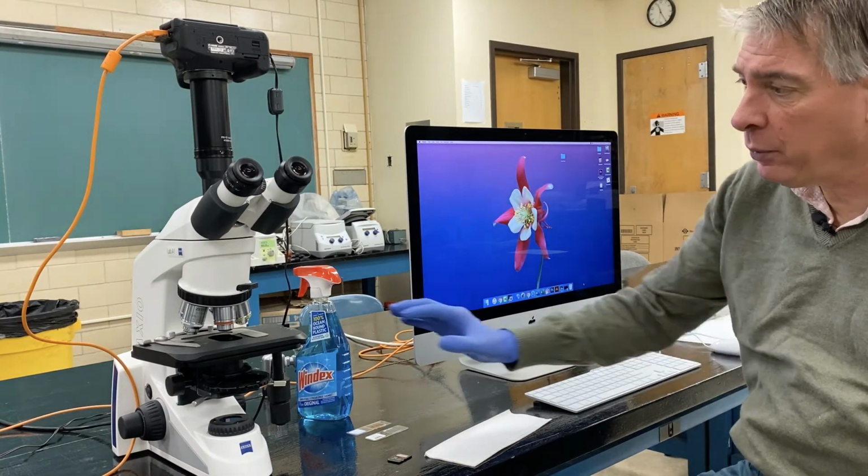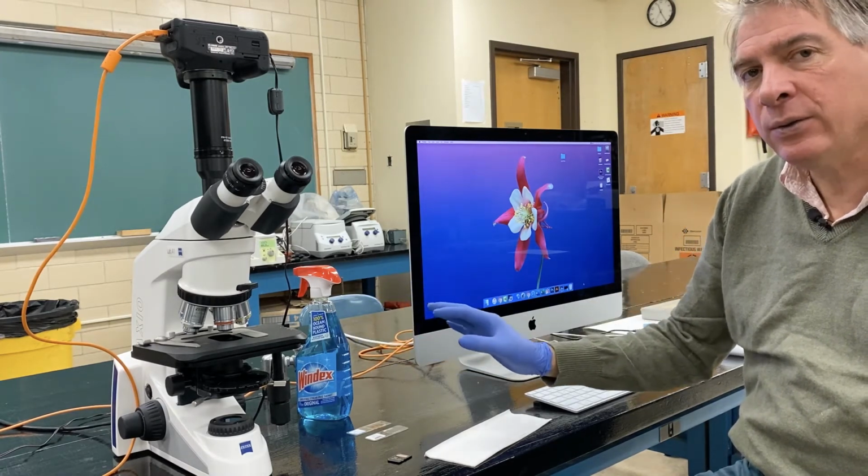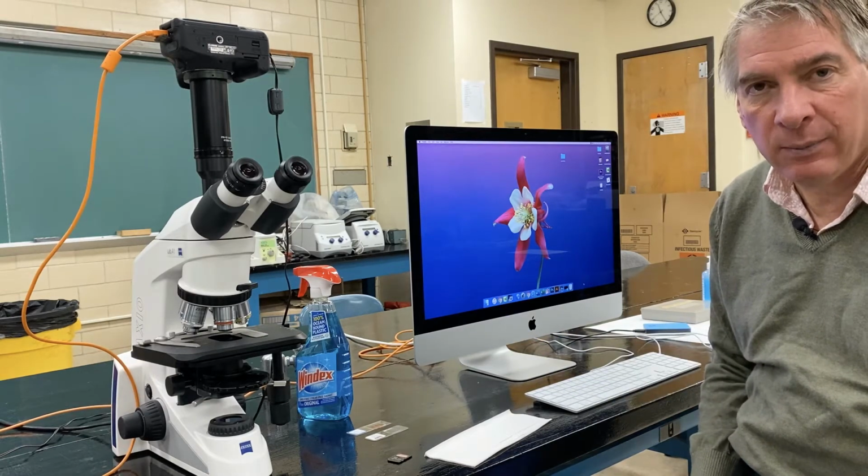Today I'm going to show you a few more features of the compound light microscope. I'm going to talk about the EOS utility software, and I'm going to show you how to put a scale bar on your scientific images.